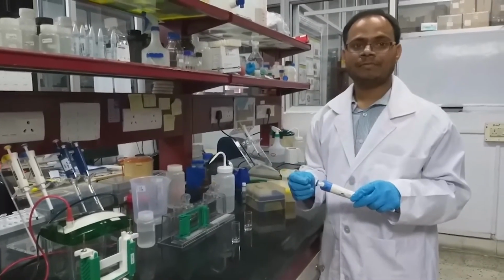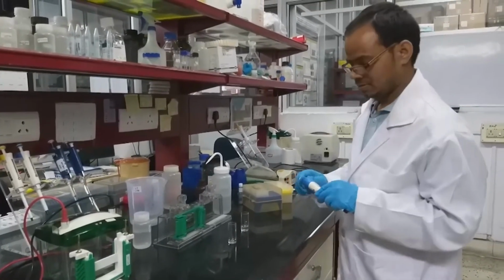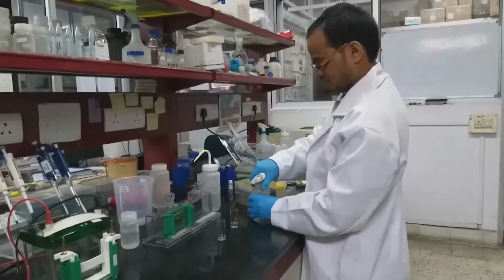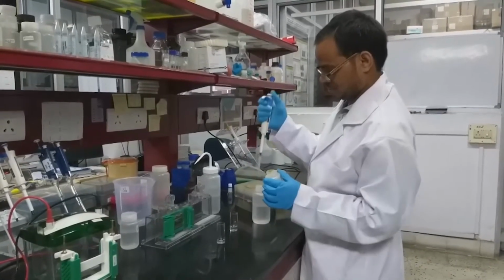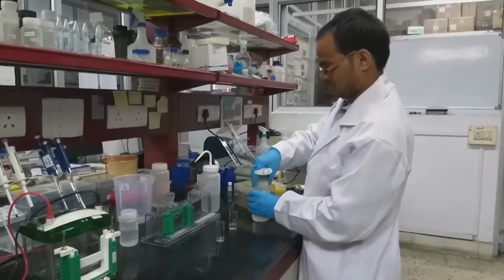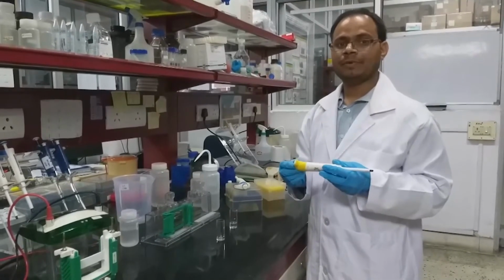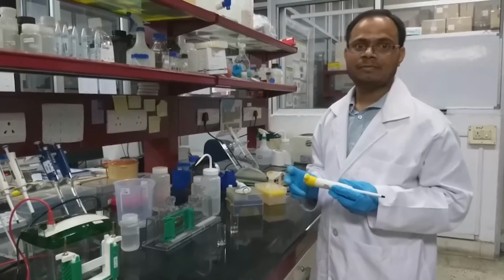Six 30 microliter of Tris HCl pH 6.8. Then 50 microliter of SDS we have to add. At the end we have to add 5 microliter of TEMED.